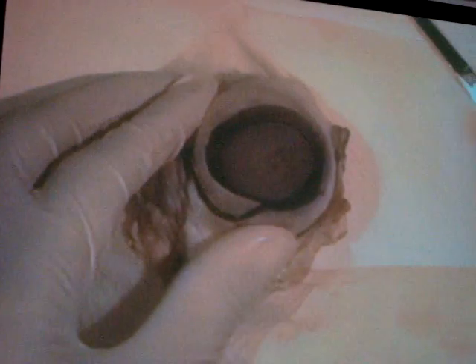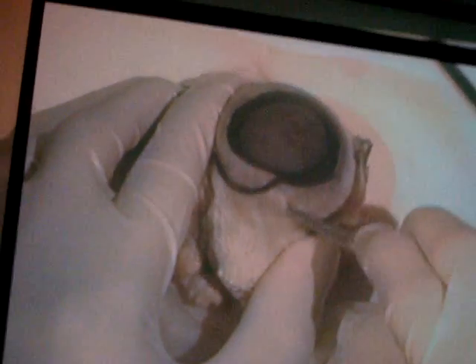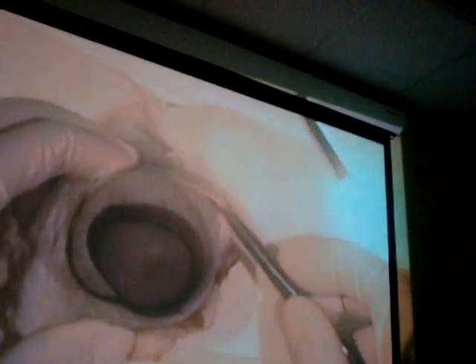This white stuff around the eye is called the white of the eye, also known as the sclera. Whether you call it the sclera or the white of the eye, both terms mean the same thing.